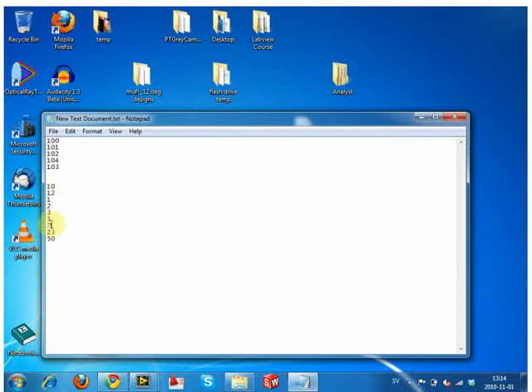Then it goes 1, and now my next number is 2. Oh, I've got another 2 down here with an index on it. So then it would put it right there. So you can quite quickly see how out of order your things go if you just allow Windows or Labview to order them itself, because the way it knows how to number things is it goes from left to right. And for most things that's fine, as long as the program that wrote the file number is reading the file number, because it knows how it wrote it. And a lot of times with Labview, you're actually analyzing data from different locations, different sources.